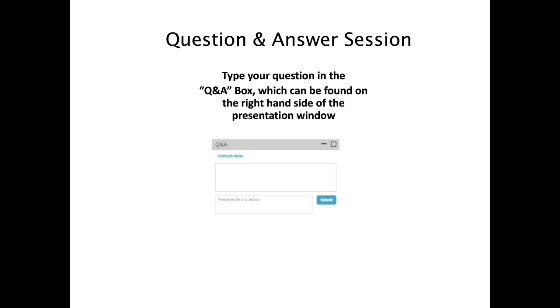Great. Here's a related question. What about ID? How do I know if the internal diameter I choose for the Halo column will work with my instrument? So first, you would need to know the dispersion of your instrument, and that would need to be measured. If you have an instrument with low dispersion, then you'd be able to use 2.1, 3.0, or 4.6 millimeter ID columns without having to worry about loss of performance. But if you have a legacy HPLC with a lot of dispersion, then you're not able to optimize it, you might not want to use a 2.1 millimeter ID column.